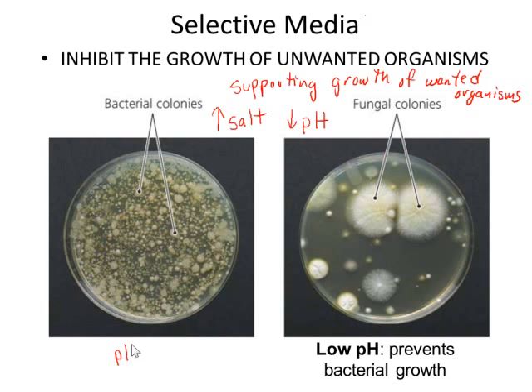Here I have a soil sample with a pH of 7. Notice all the bacteria growing in that soil sample at that pH. But take that same sample and add it to this selective media that has a pH of about 5, and notice how much less growth we have total here. And notice what's growing looks very different at a pH of 5 than what was growing at a pH of 7.